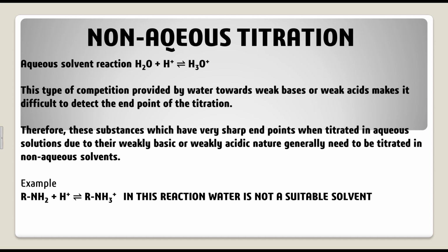So, non-aqueous titration comes into the picture and plays a major role while doing this kind of titration, when using amine and other organic compounds.